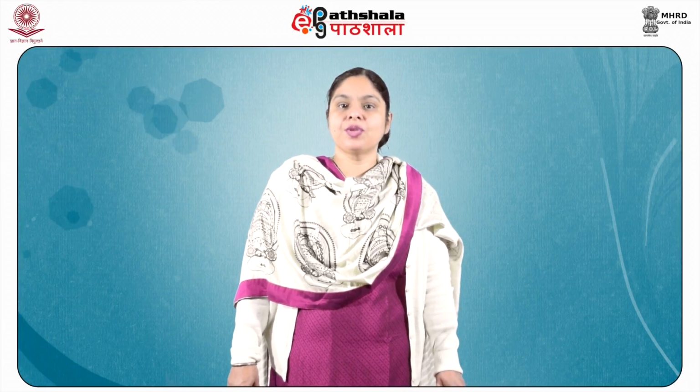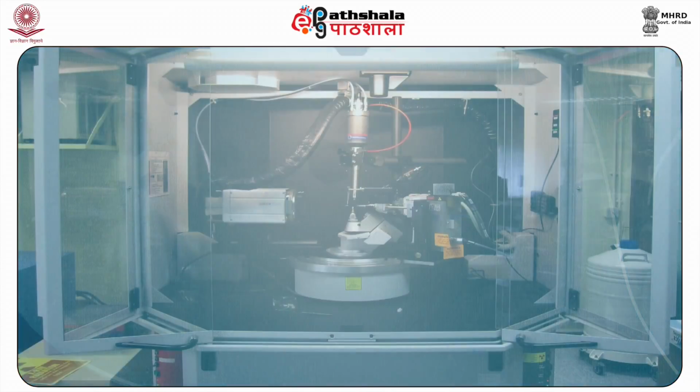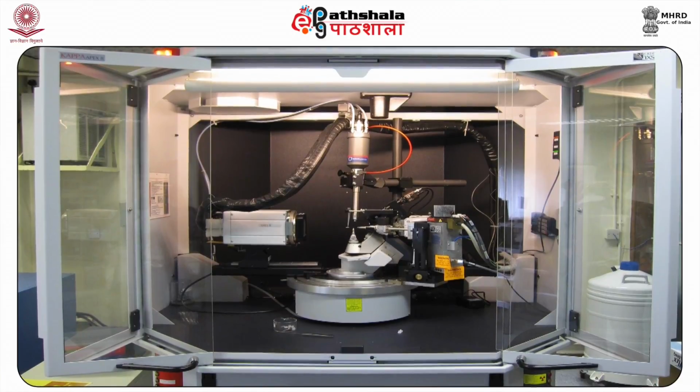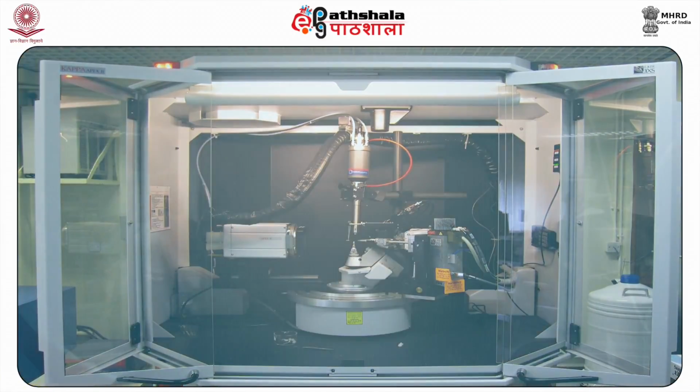The intensities of the diffracted beam in this method are then recorded by a detector which is fixed on a movable carriage, which can also be further rotated. So the angle position thus can be measured in terms of angle 2 theta, where theta is the angle of diffraction. Now powder diffraction data are presented as a diffractogram in which the diffracted intensity is shown as a function of the scattering angle.